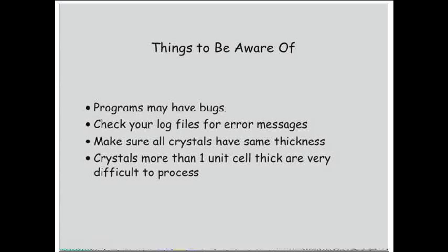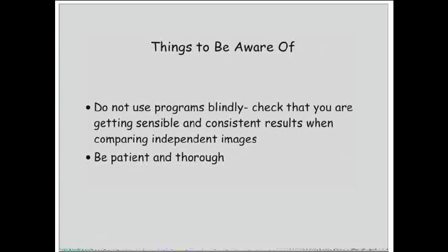Obviously, you need to make sure all your crystals have the same thickness when you're working on 3D. And if you've got more than one unit cell in this third dimension, things get very, very difficult. So hopefully you're working on very thin, single-layered crystals.